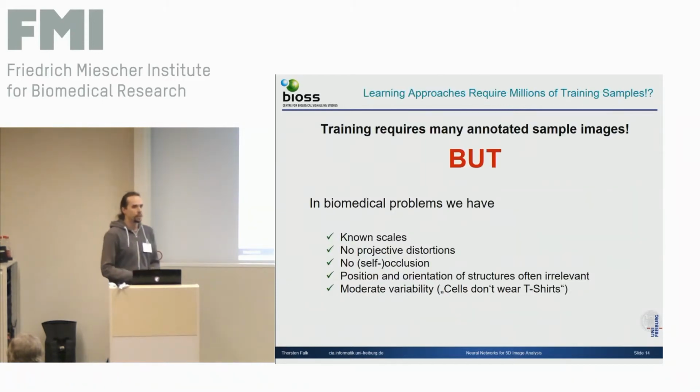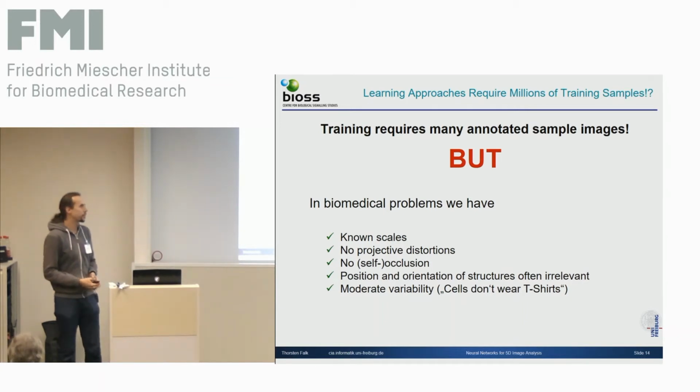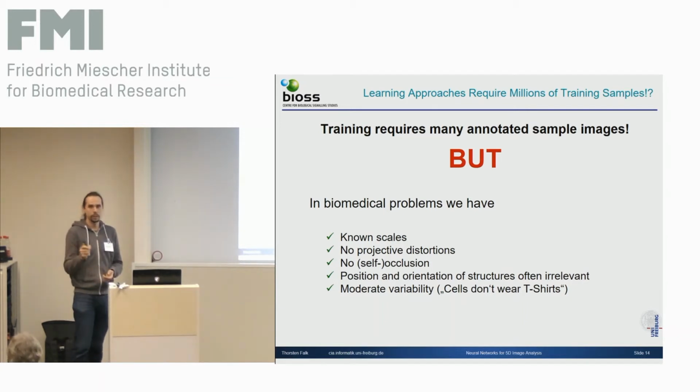The uncool thing about it is that it is a learning approach, so you need training data. And we already talked about that. And I like the approach with only scribbling some of the structures you're interested in. It's definitely a good idea to do that if it is possible, because it is really less effort. If you have problems that are not solvable by something like putting some scribbles or just a threshold, for example, then the networks come into play. I would not try to solve every problem with networks. If it is too easy, do it another way, it is faster.